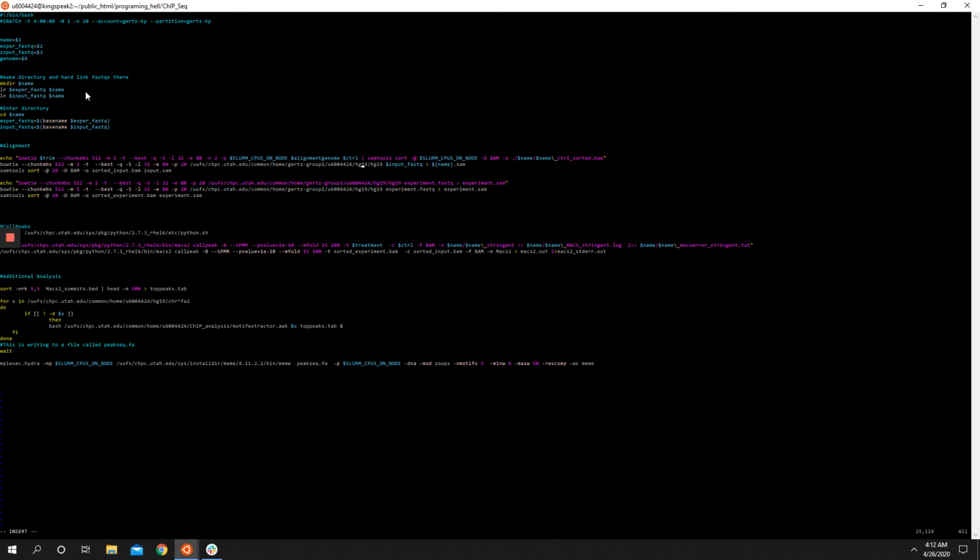I've actually got several different genomes in this location, including HG38, in a similar setup where the indexes are named inside a folder with the same name. So we can just do $genome, then $genome. Now it's not hard-set what genome they're writing to.